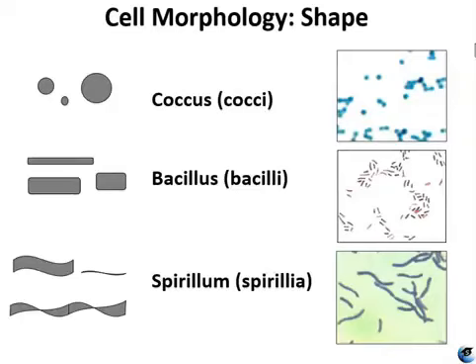That's a colony morphology. And they have lots of different descriptors like size, color, margin, elevation, all of that stuff. Cell morphologies are a lot more specific and a lot more difficult to observe because now you're not looking at a huge aggregation of cells. Now you want to look at individual cells, right? So the first thing you're looking for is shape, and then the second part we'll talk about in a minute is arrangement. Cell morphology is only going to be your shape and arrangement.